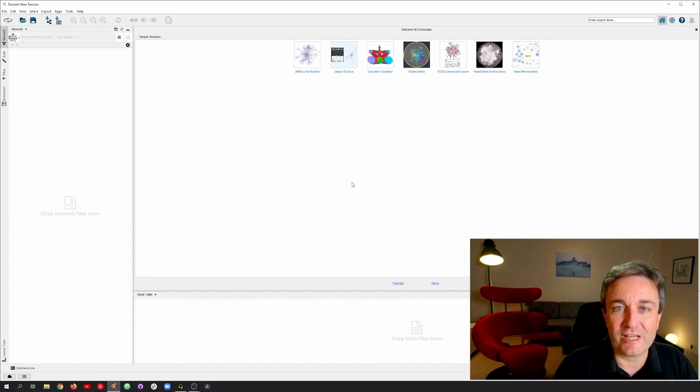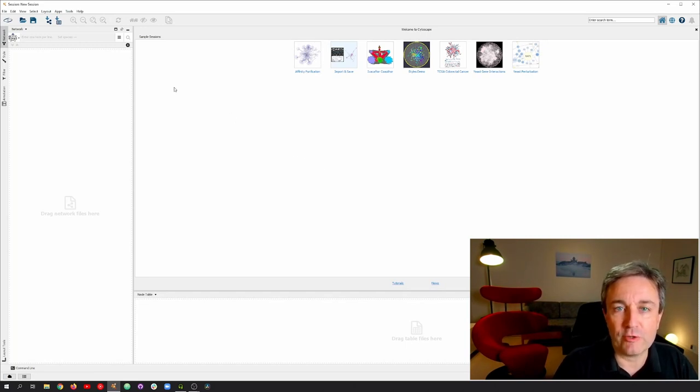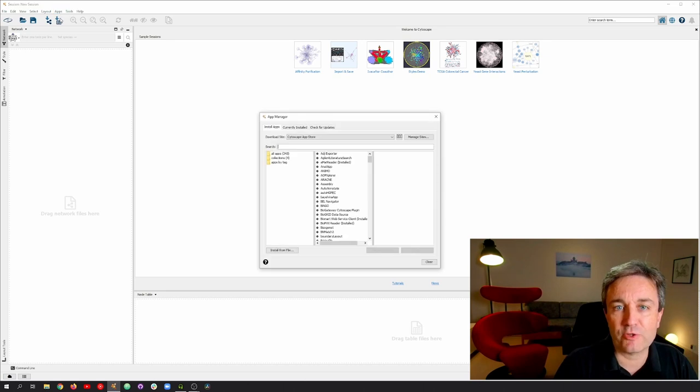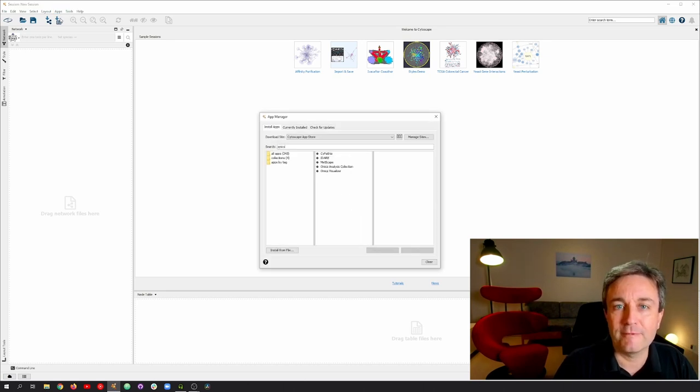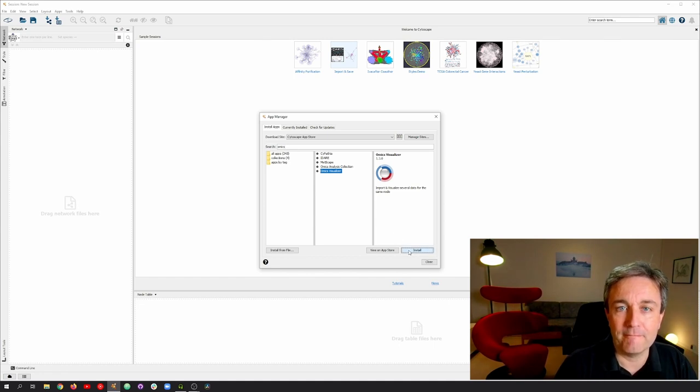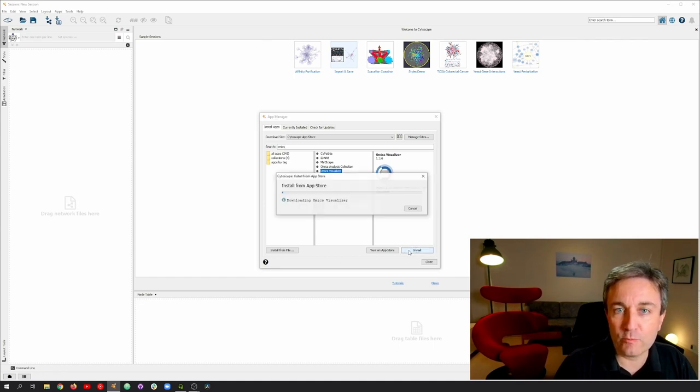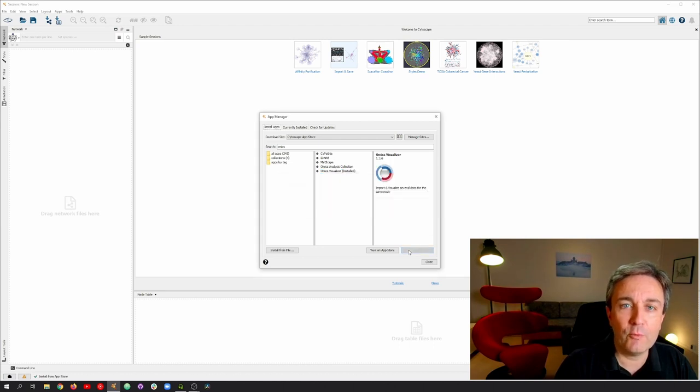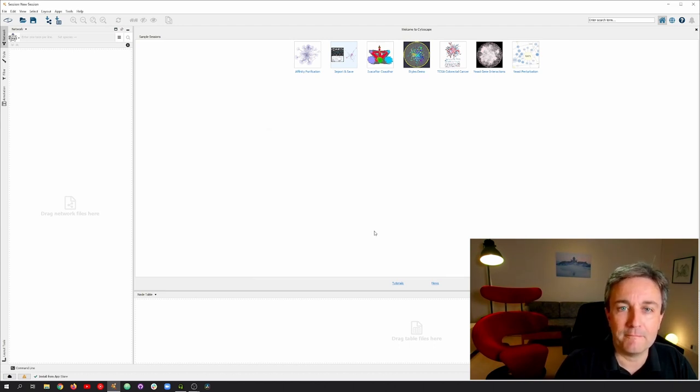Welcome to Cytoscape. To use Omics Visualizer, we must first install it by opening the App Store, searching for it, selecting Omics Visualizer, and clicking the Install button. A short moment after, the Omics Visualizer app will have been installed, and we can close the App Store again.